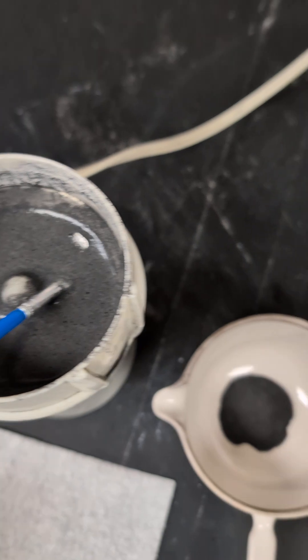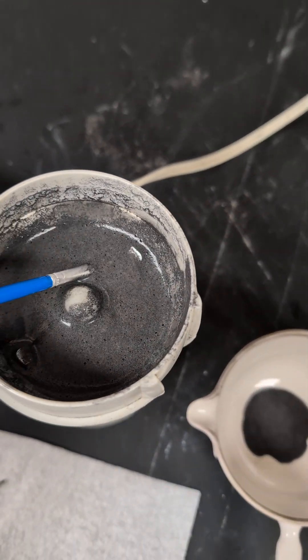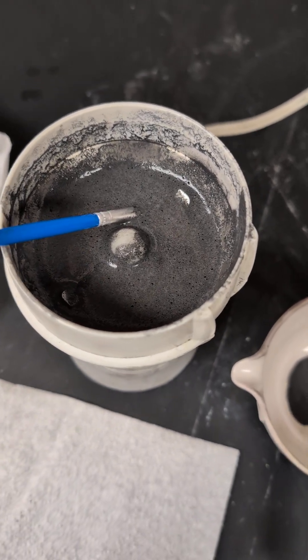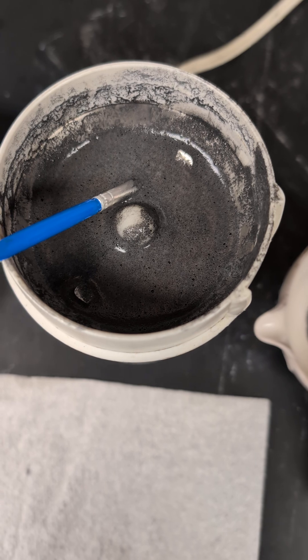We put it in the coffee grinder and then use 15-20 second intervals of grinding and rest. We don't want to build up resistance or heat.